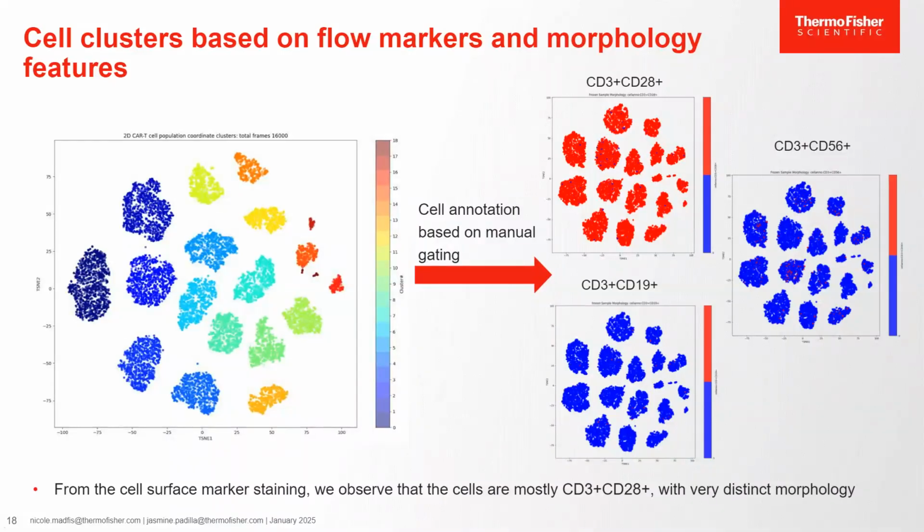Again, we see that the heterogeneity of cell morphologies in the day zero population can offer information about how the cell may behave in the future.